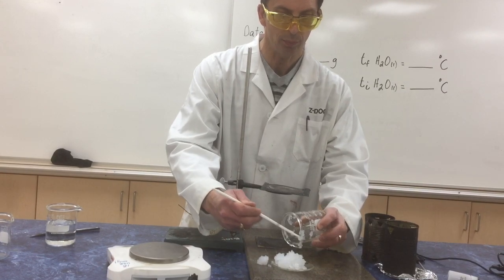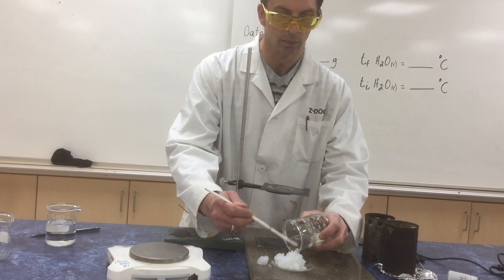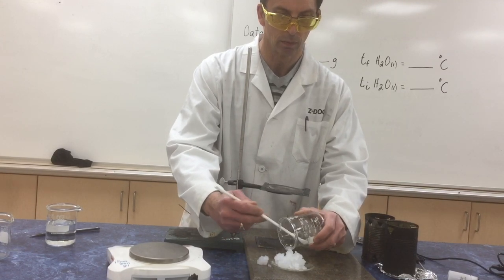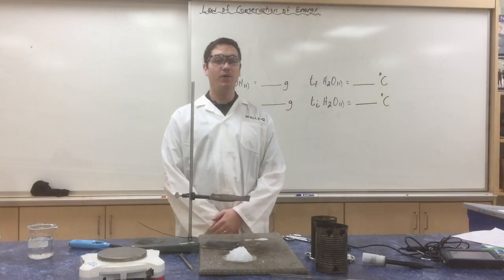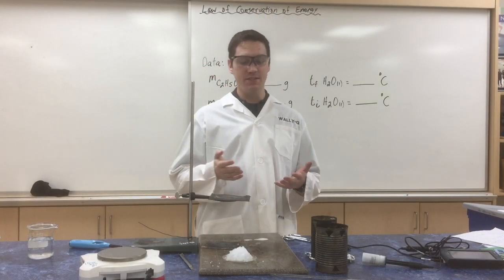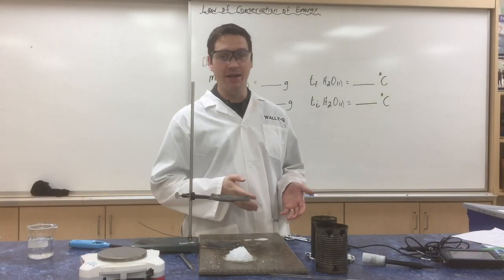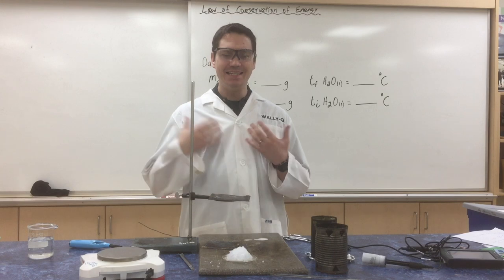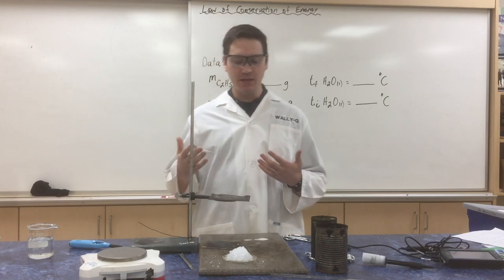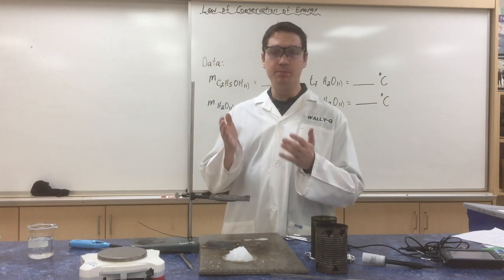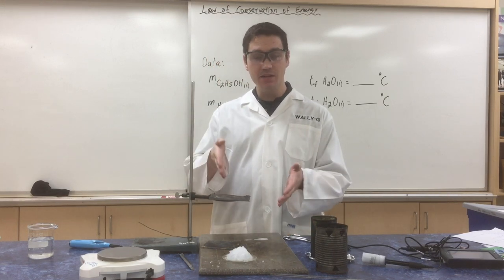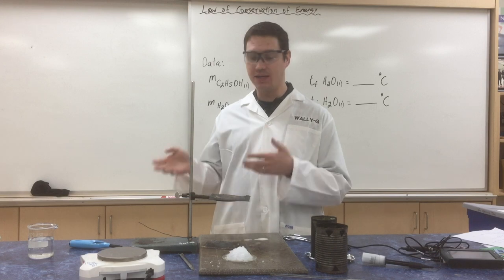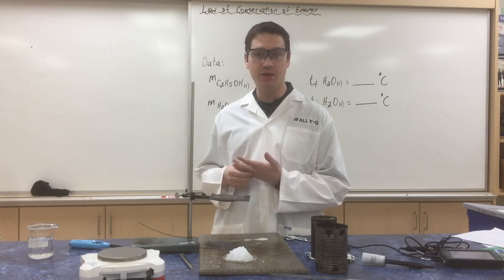Okay, so what we're going to do today is we're going to set up a metal can calorimeter. The idea being that we're going to burn the ethanol that's in the gel that we've just made out of the calcium acetate, water, and ethanol mixture.